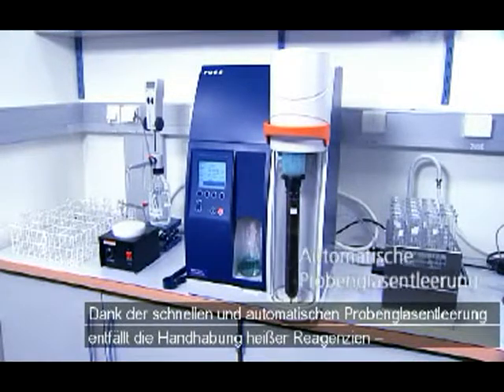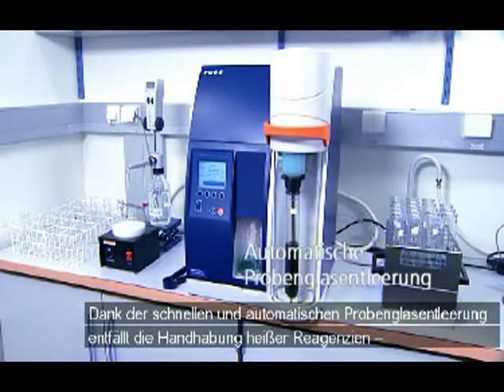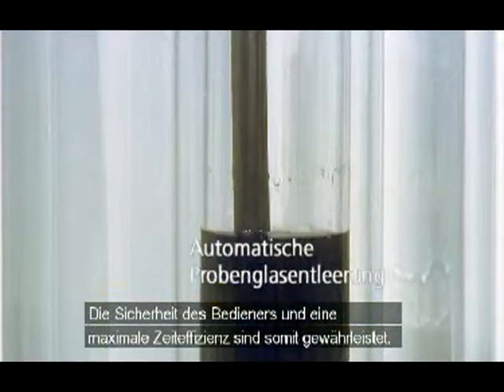Fast automatic tube draining reduces the handling of hot reagents, improving operator safety and saving time.